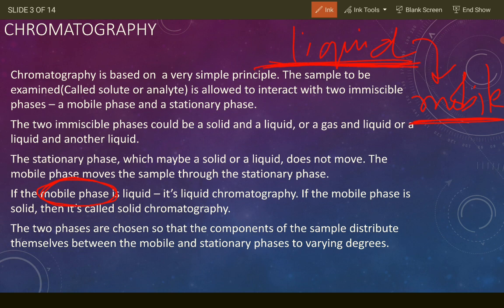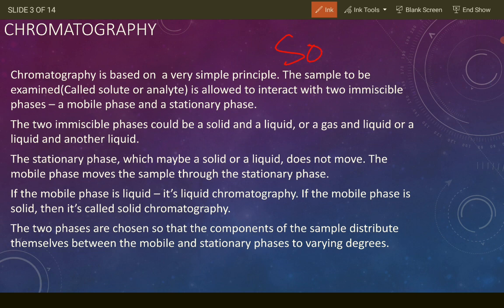If it's solid chromatography, it means that the mobile phase is solid, right? The same thing goes for gas. If the mobile phase is gas, then it's gas chromatography.